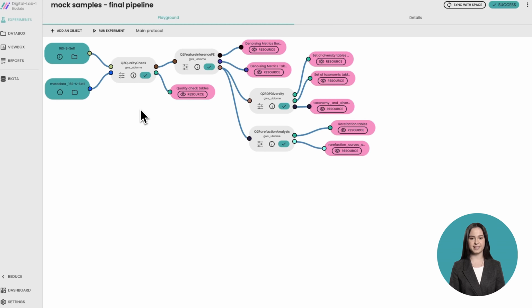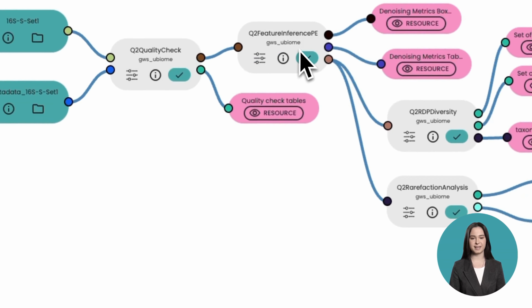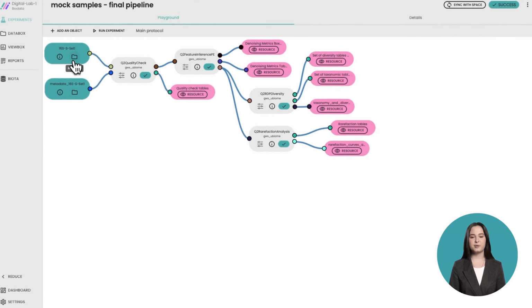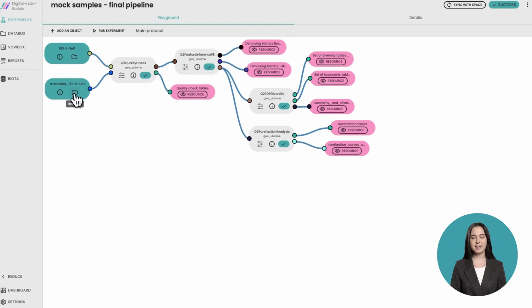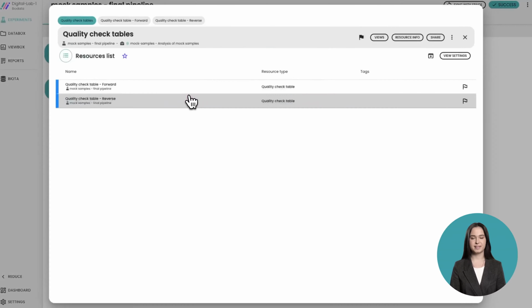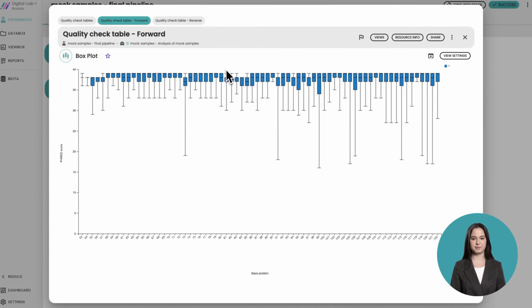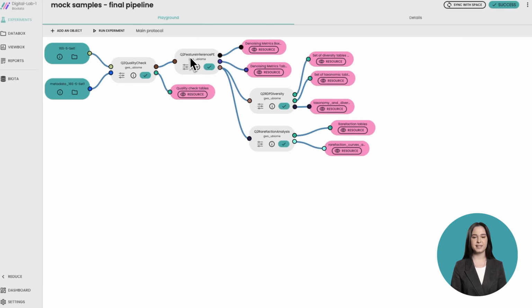accessible from Constellab community. For example, this pipeline represents a collection of tasks accessible from the uBiome brick, designed to process metabarcoding sequencing data. It receives 2 types of resources as input with green boxes: a folder containing paired-end sequencing files and a metadata file. The initial task conducts quality control and generates visualizations to assess the overall read quality. These visuals are designed to guide decision-making and fine-tune the parameters for the subsequent tasks.